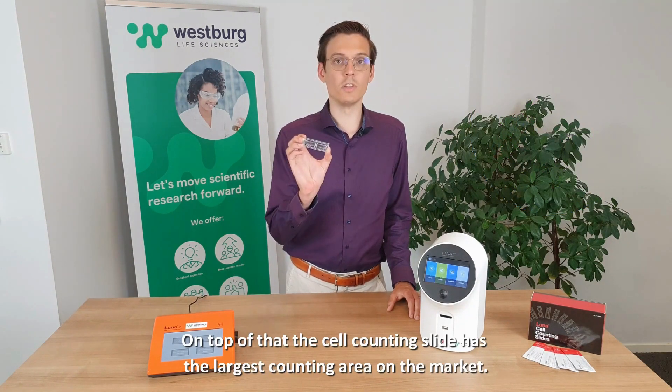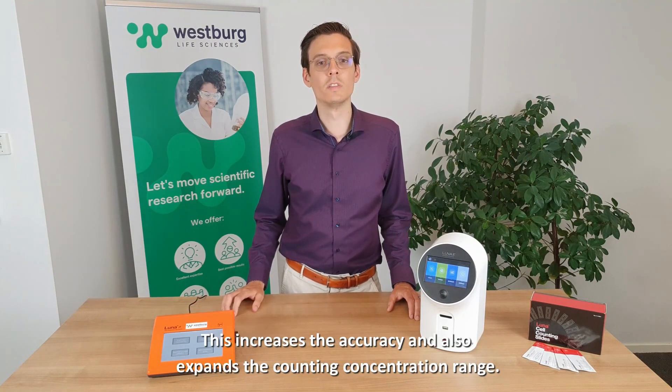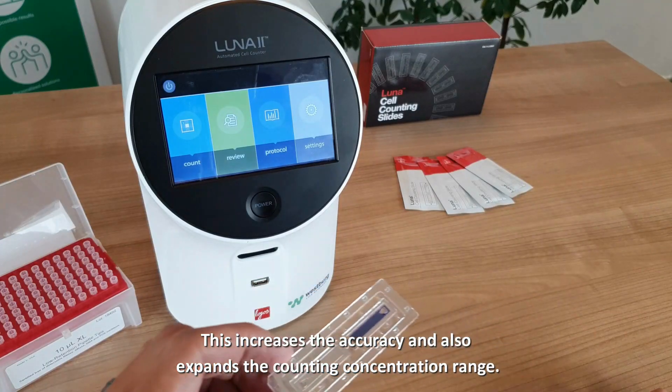On top of that, the cell counting slides have the largest counting area on the market. This increases the accuracy and also expands the counting concentration range.